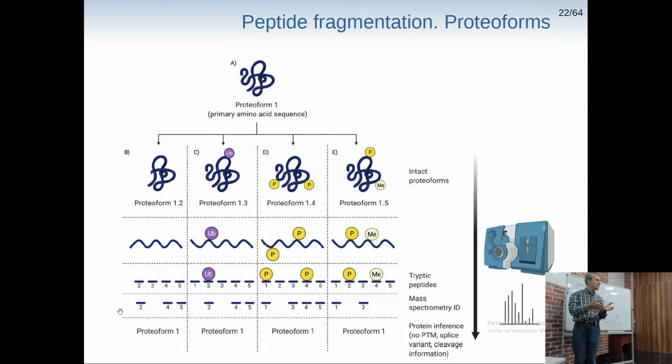It has a bigger mass, for example. Yes, you can get the mass of the whole protein, right? And see whether there is a difference, because most of those post-translational modifications are big enough, except for phosphorylation, right? For phosphorylation, you can use special dyes, for instance, to make a 2D gel, and you will have those two different proteoforms, right?